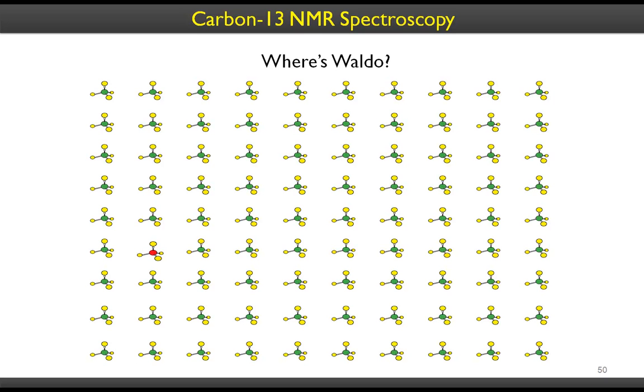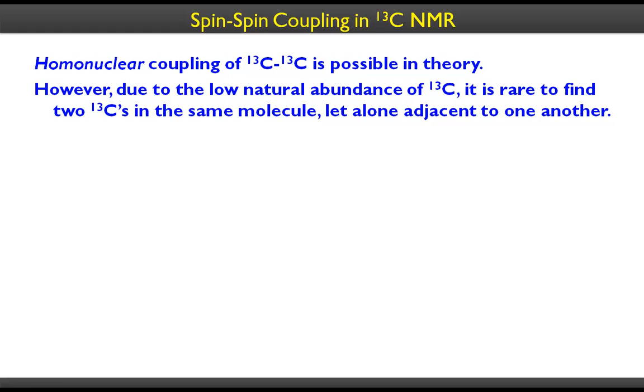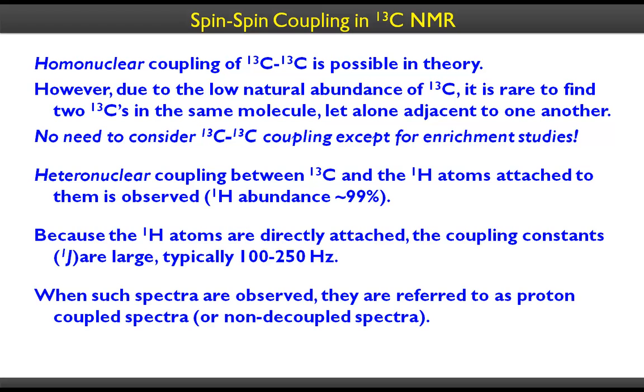If you want to understand what we were talking about, the C13 coupling: we only have one C13 molecule out of 100 molecules, so there is no way that this C13 nucleus would find another C13 nucleus to couple with. So it's a pretty remote chance. Probably one in 10,000 or so would have that coupling, and that would go into the noise. Okay, so I'm going to skip some of these things that we already discussed, these points.